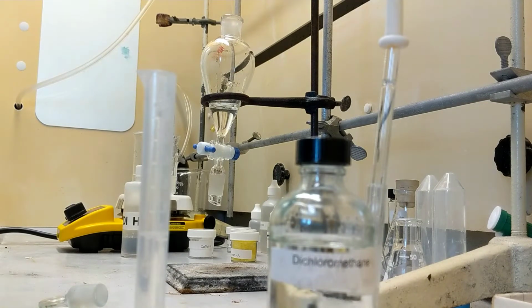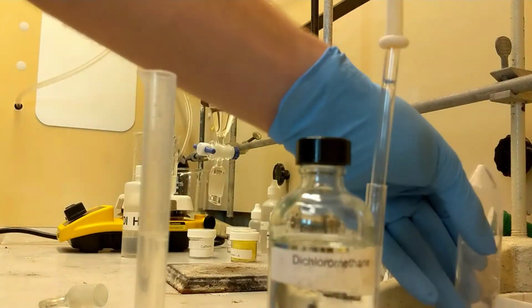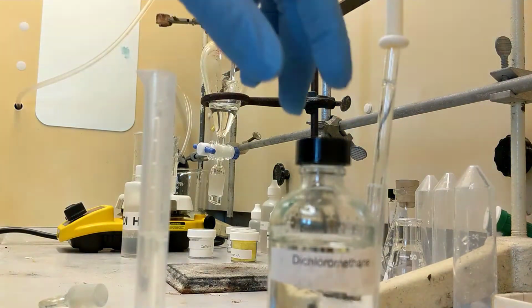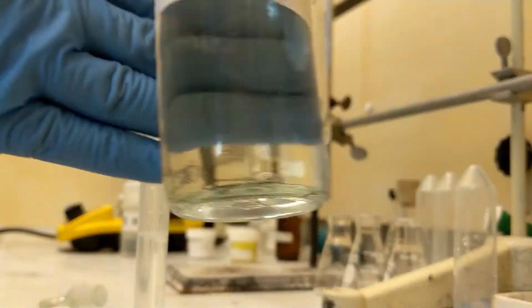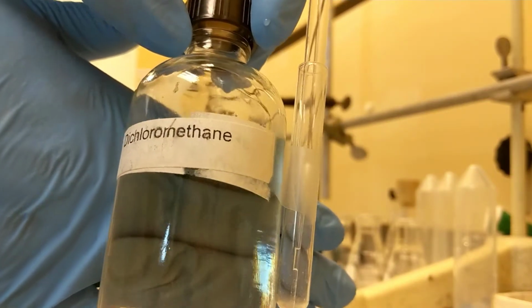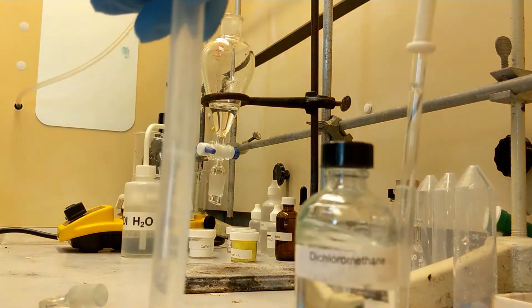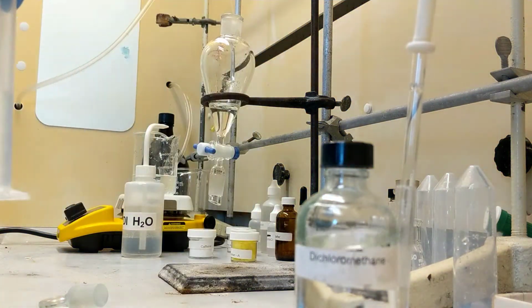Got all of it transferred. Boom. Alright. Now that I've done that, set that aside. Now I'm going to add 5 milliliters of methylene chloride, also known as dichloromethane. 5 milliliters that I've put in this graduated cylinder, I'm going to add into my separatory funnel.